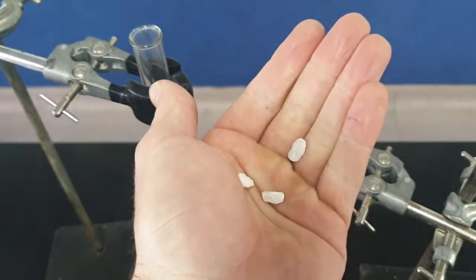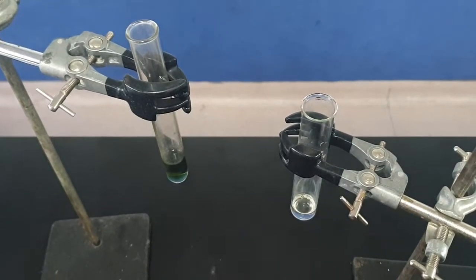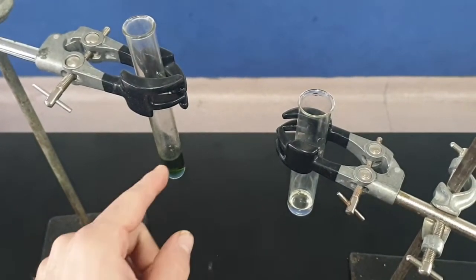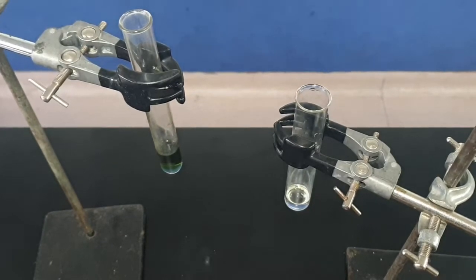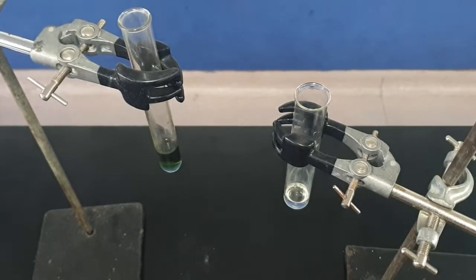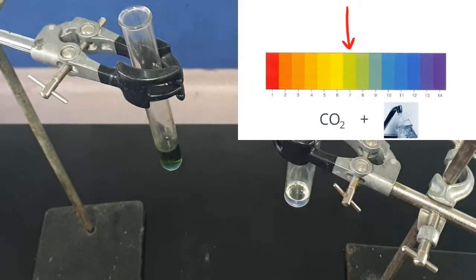So we're going to put the marble chips into this test tube, and we're going to catch the air that's coming off it and run it into this test tube here. Since the gas is carbon dioxide, what we're going to be looking for is the indicator turning yellow, because when carbon dioxide mixes with water, it makes carbonic acid.